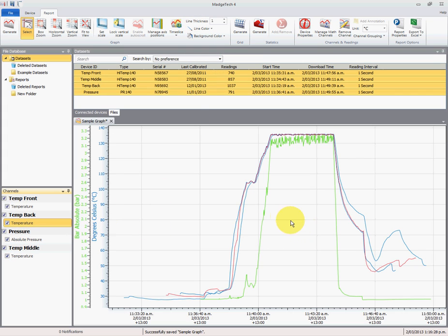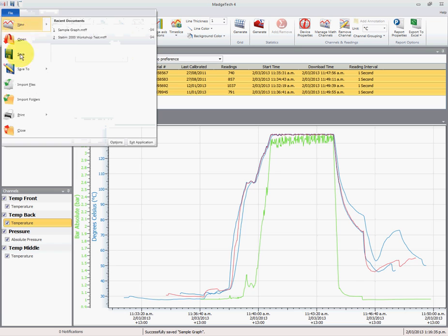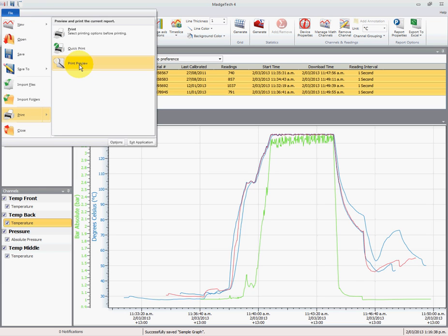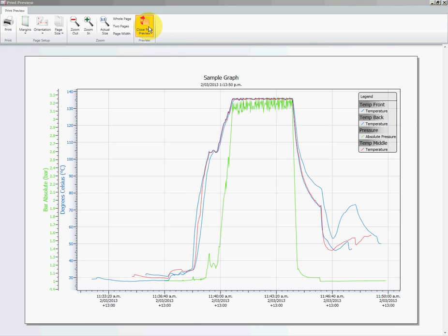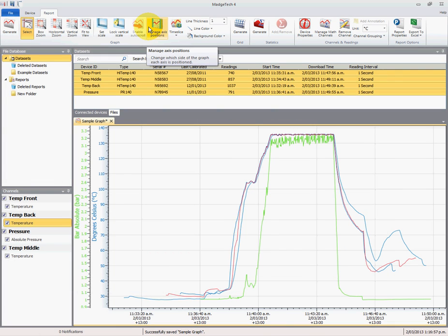And the pressure is green, so that's fine, and we've really created all the information on here that I would ordinarily do for presentation for a client. The client name I would use where I've put the title. We've got each data set with its own color, so it's easy to have a look to see what's happening on the graph. So let's close the window and we'll save that report there.